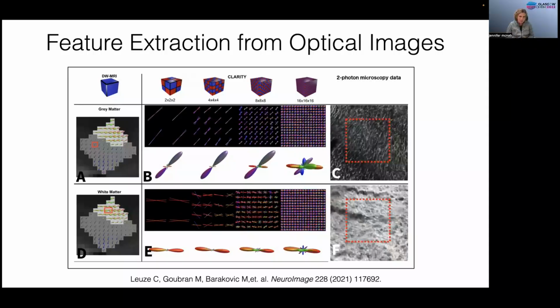And it turns out it is quite important to think about that closely, and think about the size of the structure within the histology that you're trying to capture and how that relates to image resolution and how that might relate to your MRI data and the sensitivity you have to different sizes of features in the MRI data.